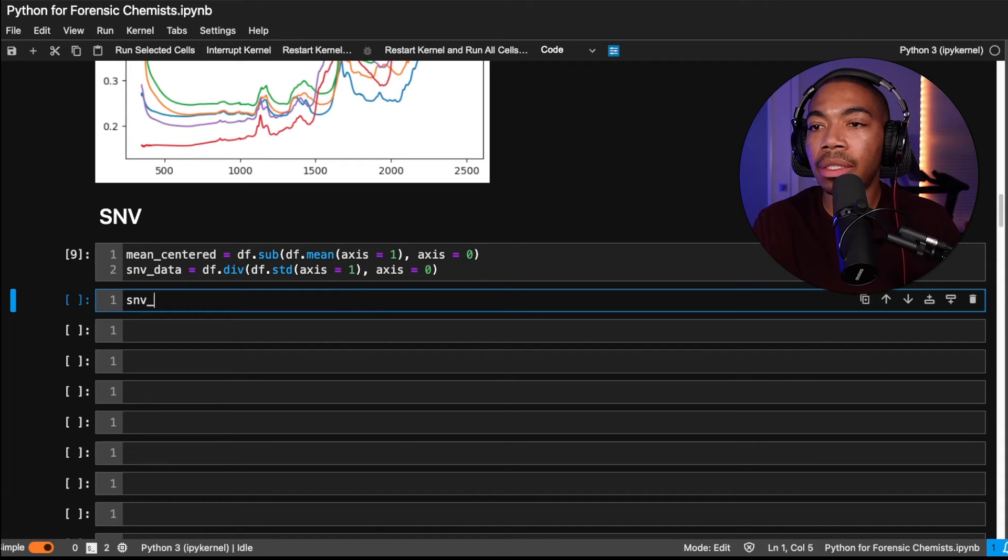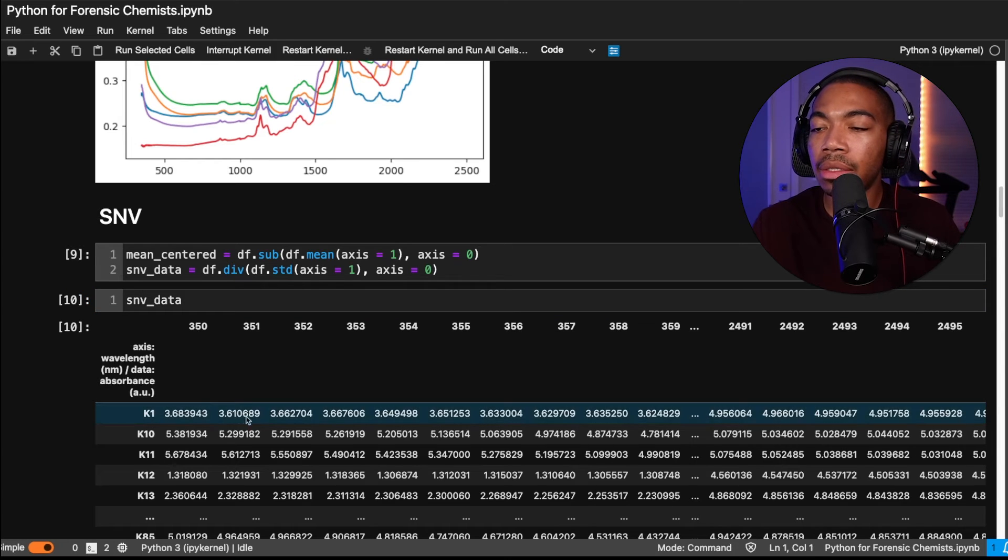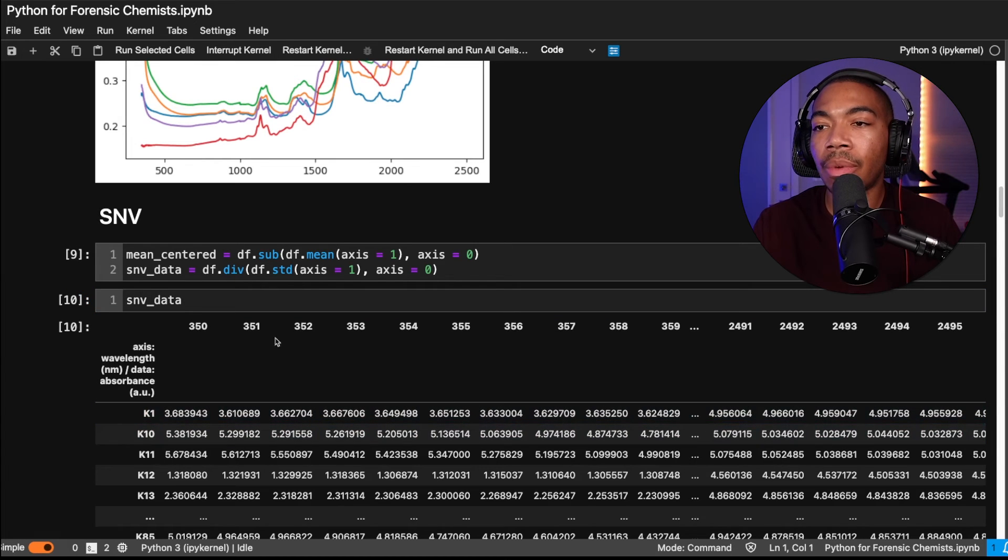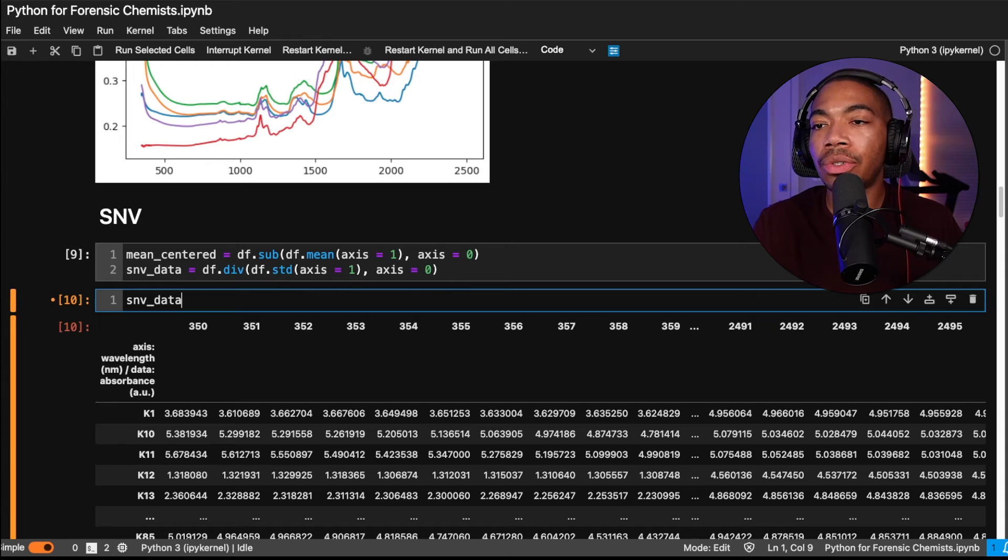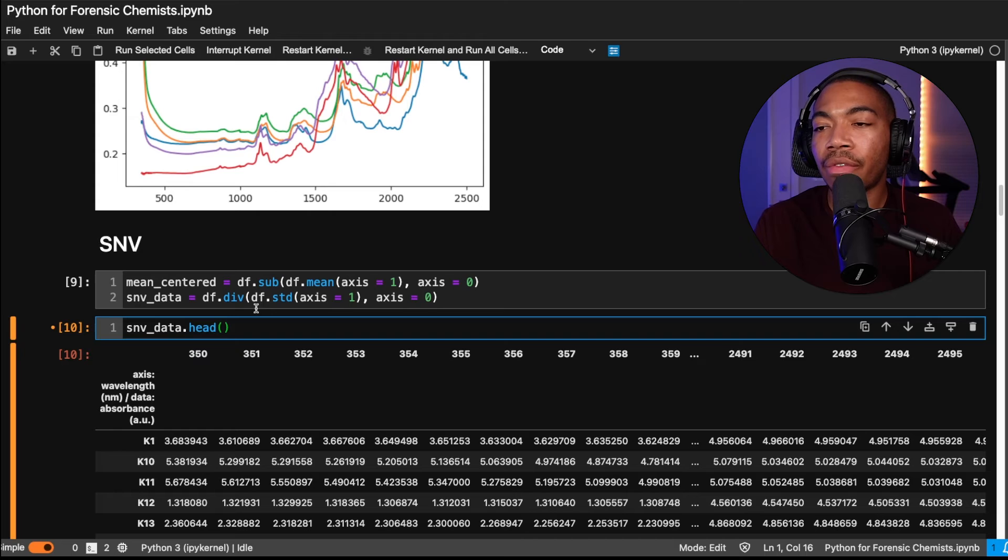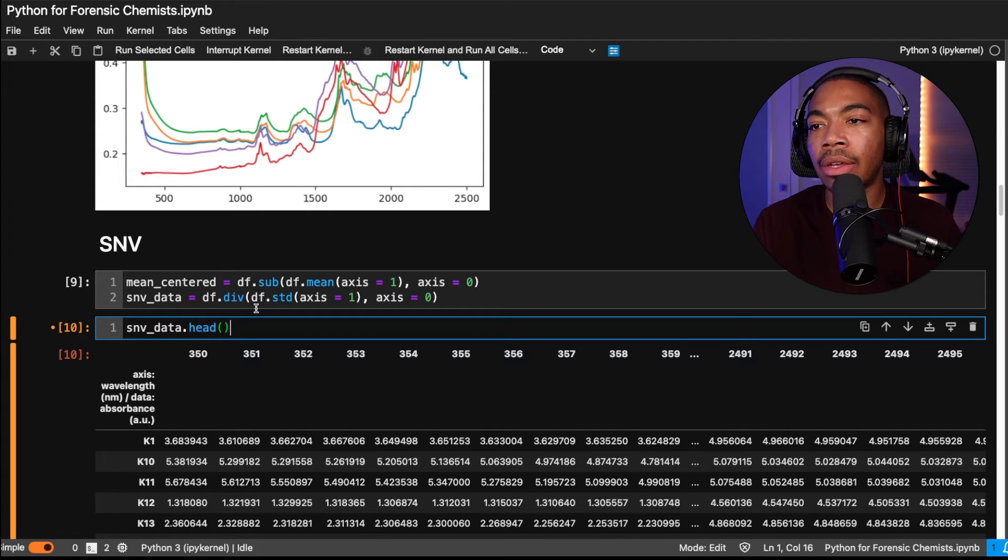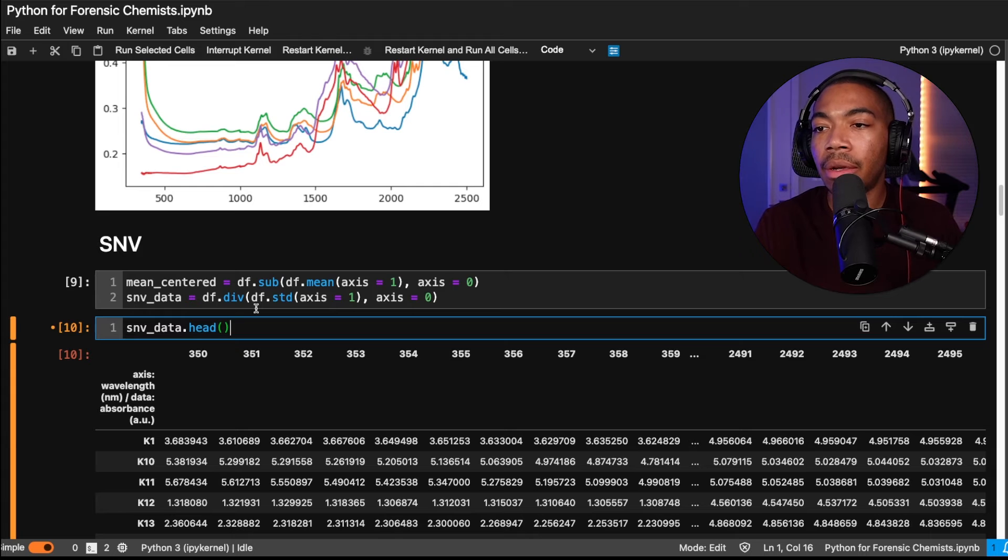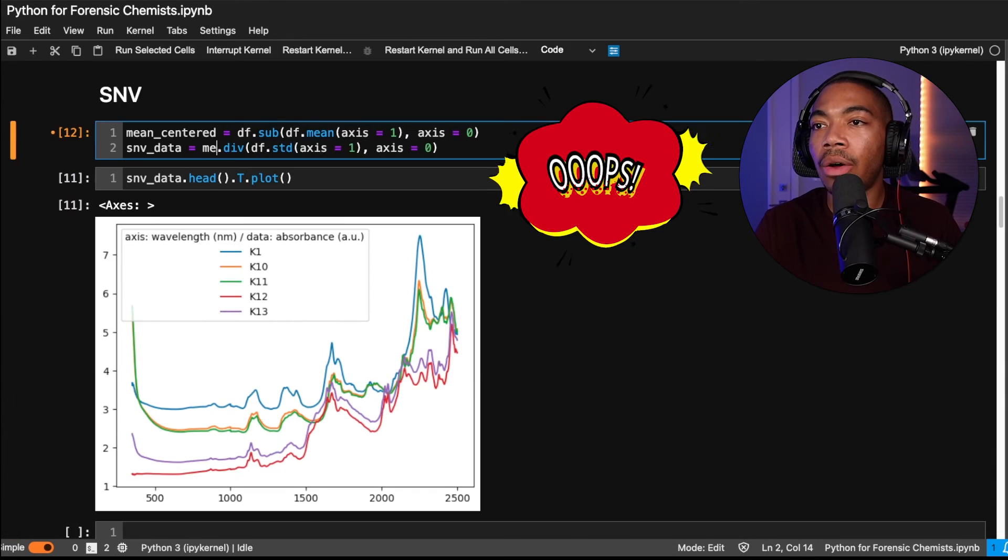And so when we look at this data frame, it looks somewhat similar to what we had before. However, if we plot it, we can start to see some of the differences that occur as a function of this preprocessing step. Let's plot the first five rows because it's a little difficult to see the impact of this preprocessing without looking at some of the spectra together. And so we have our head. Let's transpose and let's plot this.